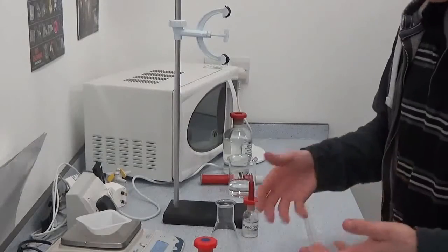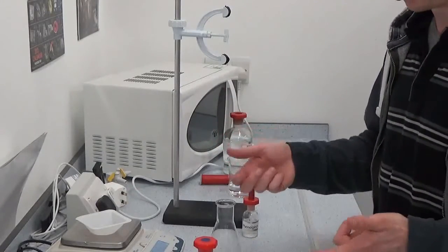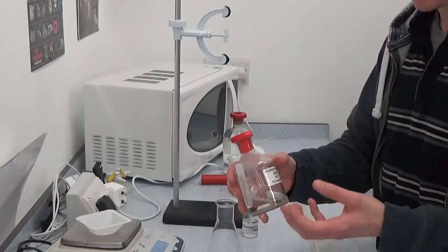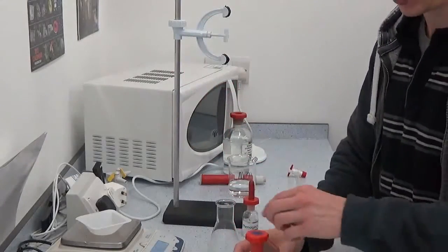I know I need around 50 cubic centimetres of hydrochloric acid to fully neutralise everything in there.